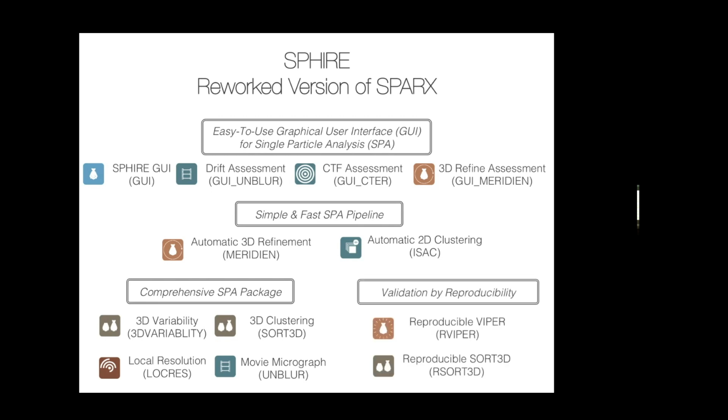We also expanded the concept of validation by reproducibility to other major steps. This approach was originally developed for ISAC 2D clustering, which is one of the most successful algorithms in our package.